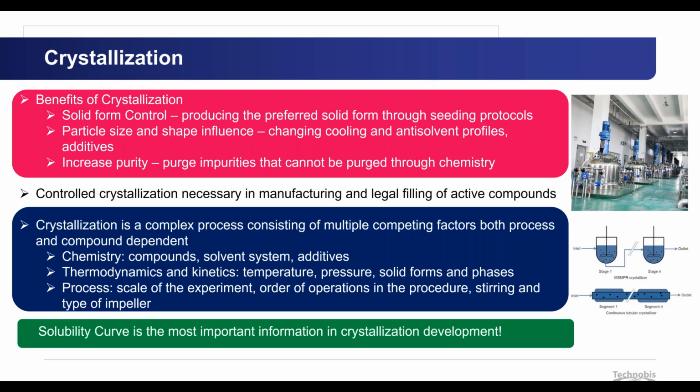Of course, if you would like to bring a solid form on the market, or even a liquid formulation, you would also want to know about crystallization, because you would like to avoid it and be able to control it. To produce at the plant scale, as in this picture, we need to consider quite a lot of parameters, factors, processes.